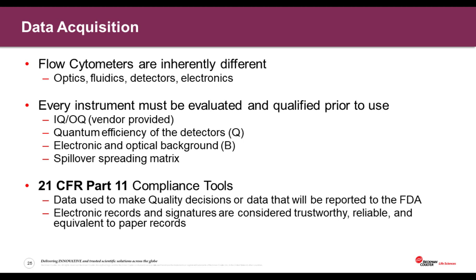Now, also, understanding the spillover spreading matrix. If you are generating your own panels, you need to understand the detectors and how different the spectral overlap of the different detectors is. So this is something that you will definitely need to evaluate if you are designing your own panels.